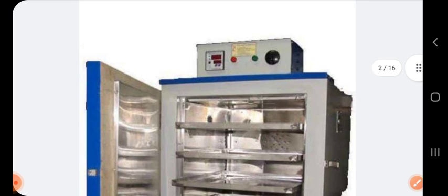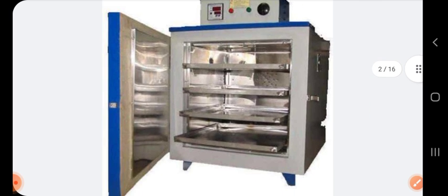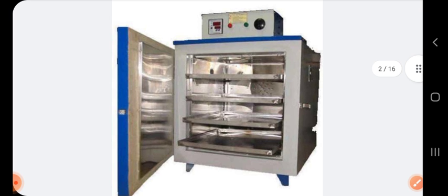So this is the image of a hot air oven. Now you have already seen a hot air oven, I hope so. A hot air oven is normally used for drying the tubes, drying all the stuff that we have washed thoroughly with water and with chemicals, okay.